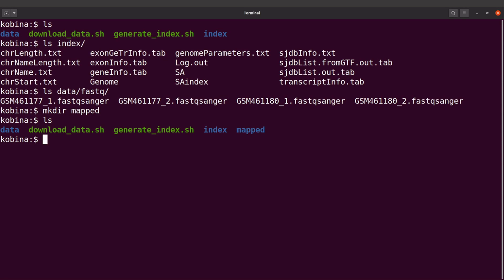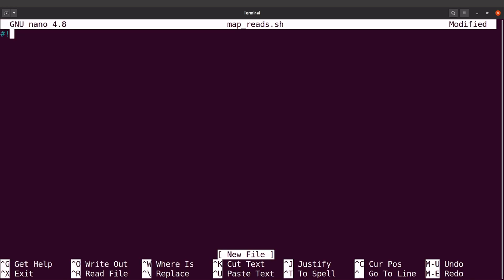You should also take note that we are dealing with more than one sample, so we need to find a way to automate the mapping process. We need to make the script generic so that we can always factor in the different samples. I'll open the script — I'll say nano map_reads.sh — and I'll start with my shebang line.